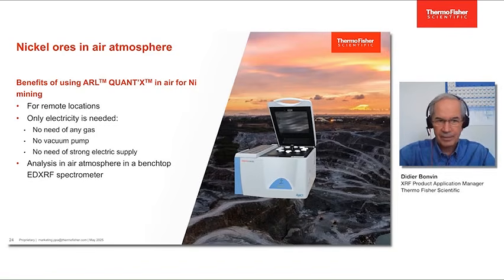We do not use a vacuum pump so that we can work with just a small amount of electricity needed for operating the spectrometer. And in that case, we need to work in air atmosphere. And let's see what we can do in air atmosphere with this benchtop spectrometer.